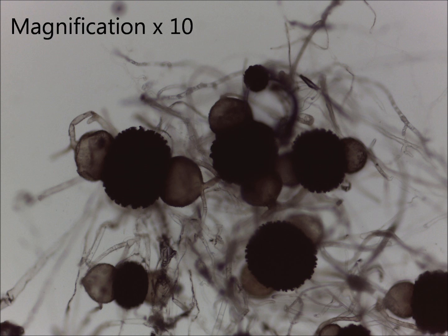This is a wet mount preparation of Rhizopus sexualis at times 10 magnification using the compound microscope. Remember, you can adjust the lighting as well as adjusting the focus so that you can see all the detail really nicely.